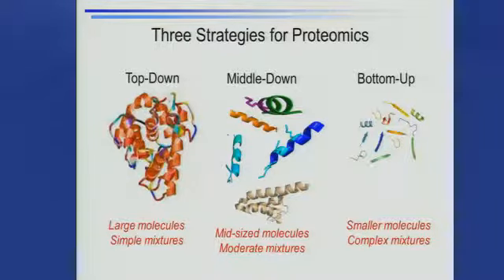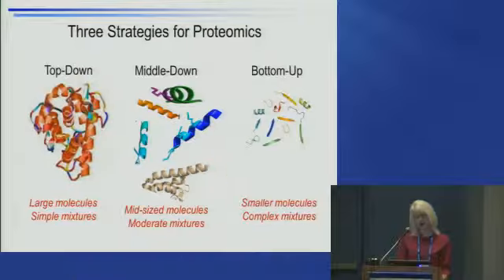And then in the middle-down methods, where you use limited proteolysis to create mid-size molecules, very, very large peptides. So the mixtures are not going to be as complex as the bottom-up methods, and you retain more of the integrity of these larger size peptides.